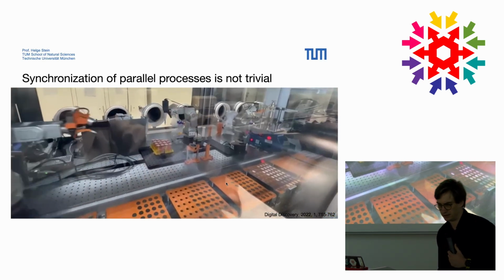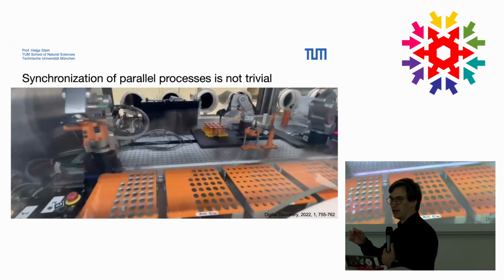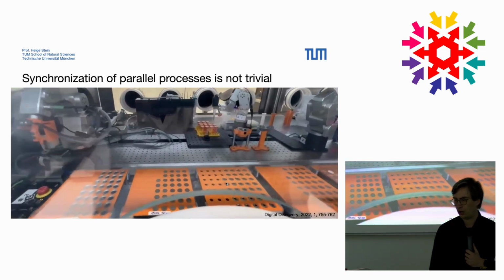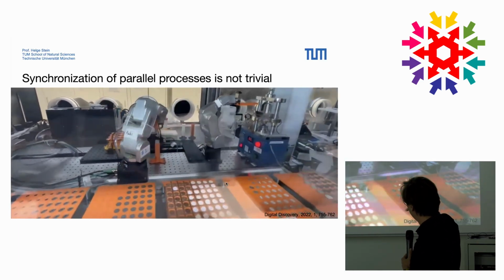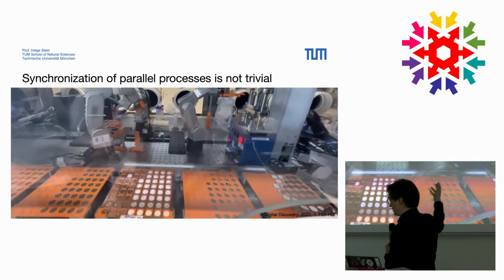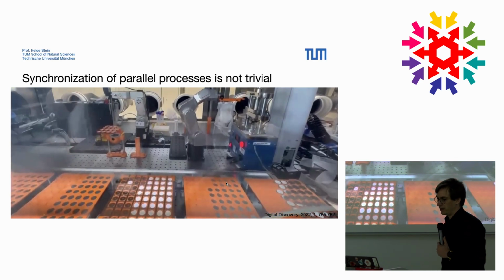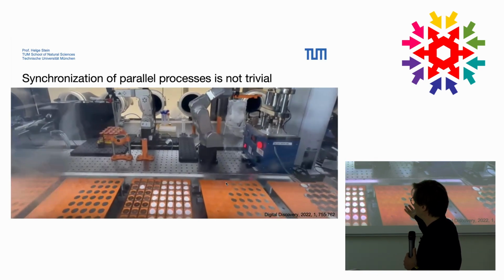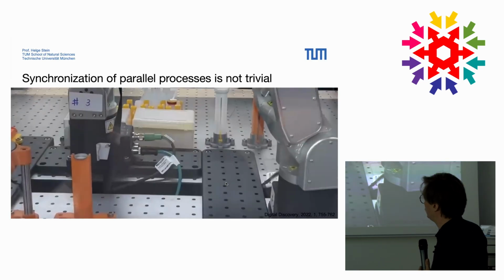We do it a little bit more complicated. That is here for the production of coin cells, which you might know from a car key or a watch. So here we have the individual components of a coin cell laid flat out here on these orange trays. We have these different robots, and all of these instruments, including the crimper and the rail, these are all web servers where we send different JSON commands to. They execute it. They tell us if they are done with the execution of their task.